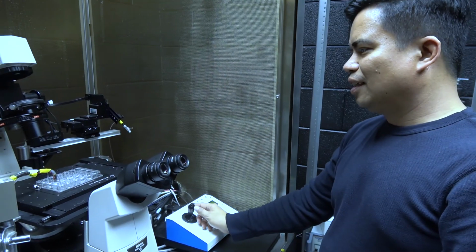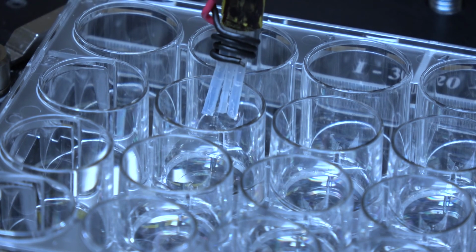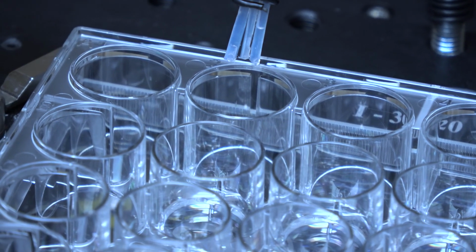Here's Leavitt. My name's Leavitt. I work for Toto as a laboratory specialist on the Constellation Pharmacology project, and I'm currently pursuing a master's degree in computer and data science. So our assay is getting to the point where it's almost as fun as a video game. The other type of technology we use is we have to apply these natural products to our cells. So to do this, we have some automatic fluidics. These are robots that control the application of fluids onto our cells.